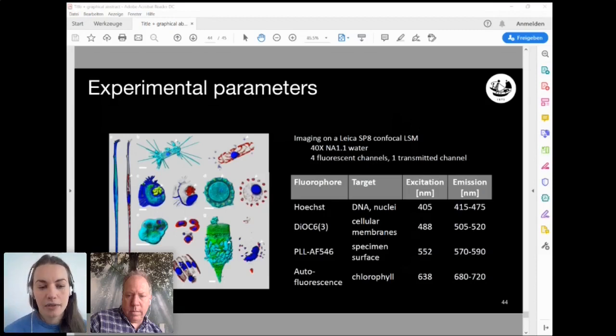Well, I think in the future it can be interesting to look also at different modalities. I know that a lot of imaging is done with SIMS and NanoSIMS, where you can look at metabolic exchange between cells. So it's not so much about resolution, but more about chemical contrast. FLIM, I'm not aware of. CARS, I'm also not aware of. They can give you more molecular contrast. Yeah, it could be interesting. We just don't have it available here at the moment.